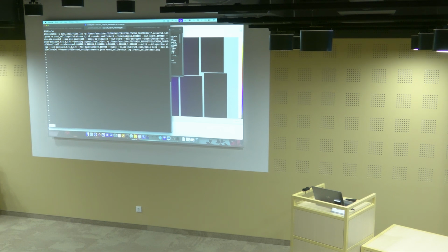So for example, we used a threshold of 55, the minimal signal to noise of 5. We used XGandalf for indexing. These are the tolerance values. Yeah, and as I said, we're not going into all of the details of the parameters here, but there are quite some parameters to play with.